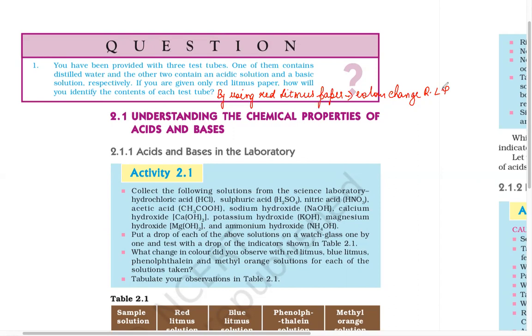If the red litmus paper changes to blue color, the solution is basic. Then it is a basic solution, isn't it?